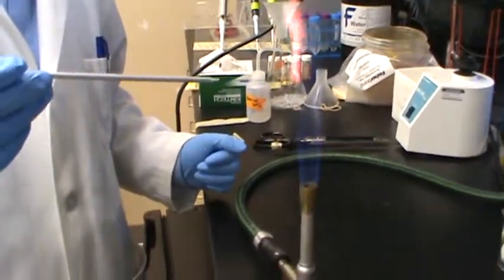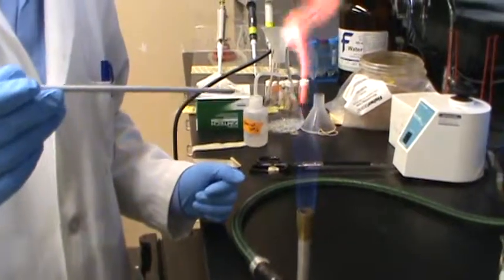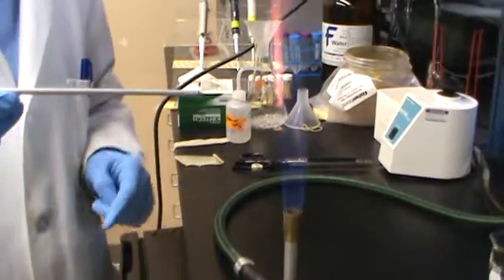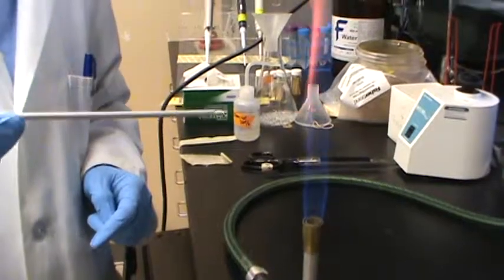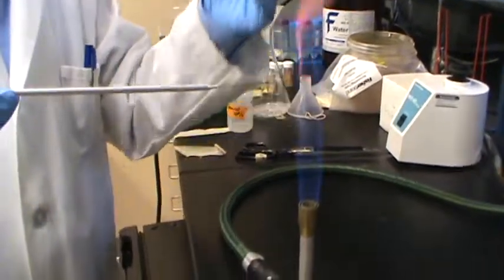Sterilize the loop. Make sure the tip of the loop is burnt red, and we should use the top part of the slant.